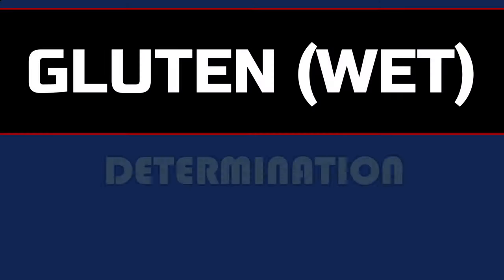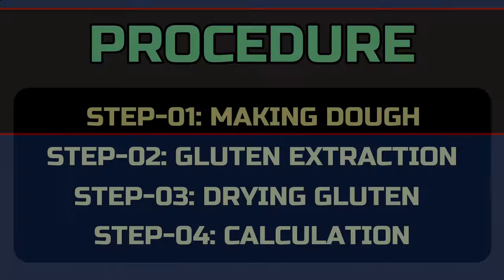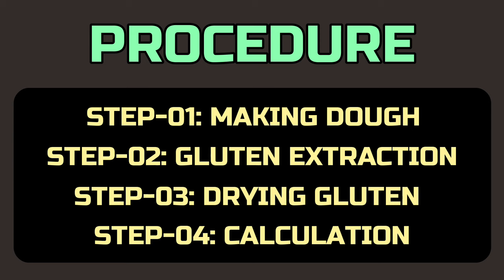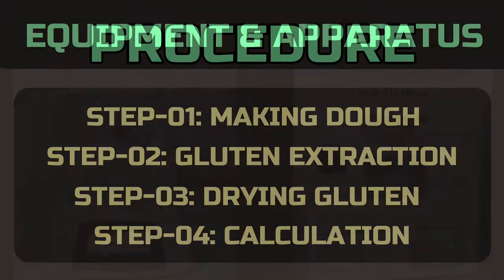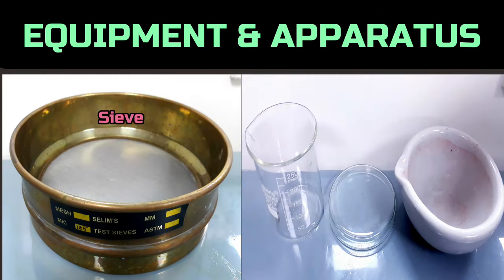Today we are going to set an experiment for the determination of gluten of a flour and wheat sample. We divided the whole procedure into four steps: making dough, gluten extraction, drying gluten, and calculation. Throughout the test, we need a balance machine, hot air oven, sieve, beaker, glass dish, and a bowl.